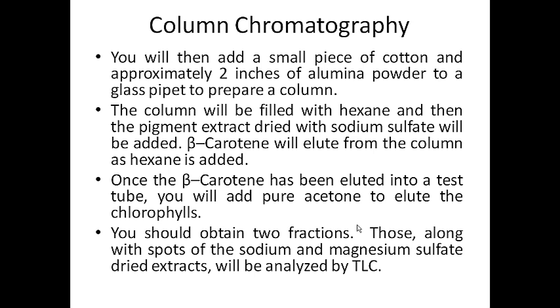We'll use TLC quite a bit to determine how many components we have and sometimes identify the components in our TLC plates. And then we will do a large column extraction of the Excedrin tablet components in a few weeks, where we're going to collect 30 or 40 fractions, and in that case the components won't have a color to them, so we'll have to figure out exactly where those components are by using TLC. So that'll be a much more in-depth use of the column chromatography.